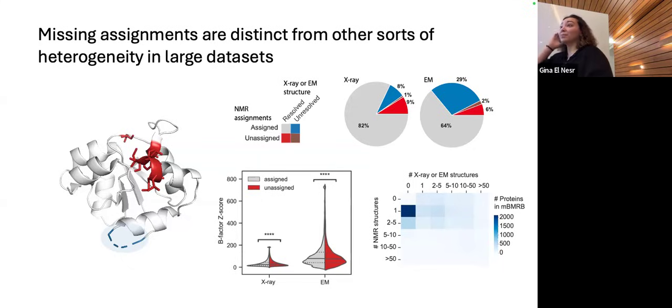Maybe this is more of a clarification question. When you say the word transformer, people assume it's like a million parameter model. Oh, it's very small, guys. This is a really tiny transformer. Do you recall roughly how many parameters? No. It's 10 layers, it has 6 heads. I don't know if anyone knows how to do the math for that, but to me, that is a fairly small transformer.